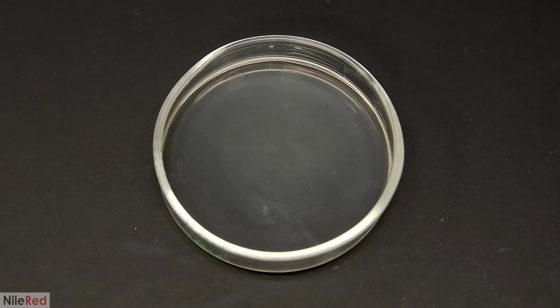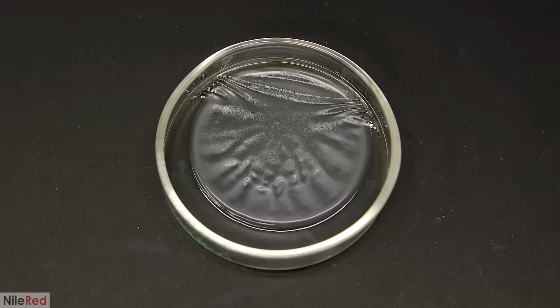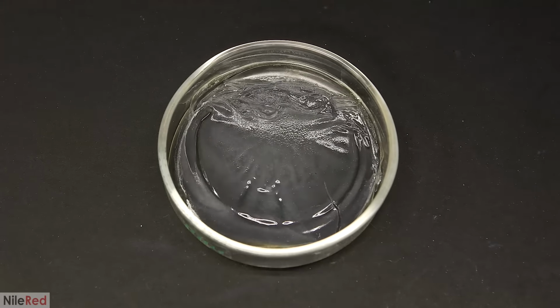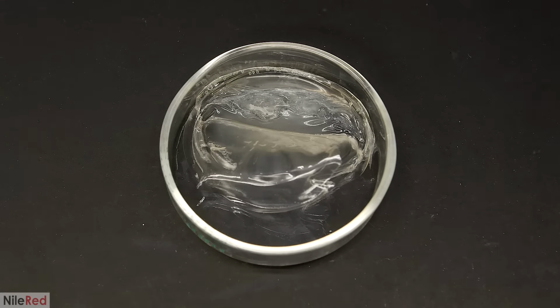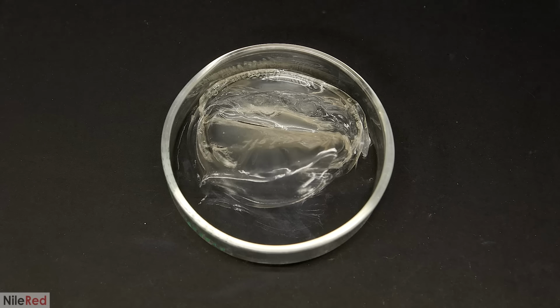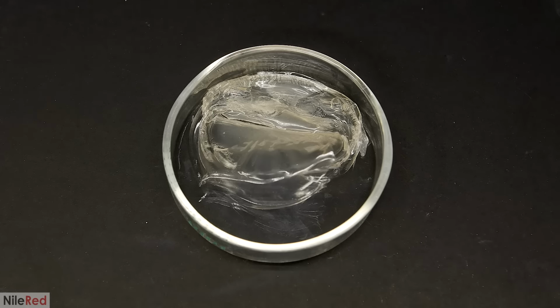I poured it all into a glass dish, and this time I decided to do a time lapse. I also wanted to see what would happen if I lightly blew on it with a fan, and the answer is that it's not good. The solvent evaporated off way too quickly, and the triacetate contracted in on itself. By the time all the solvent disappeared, what I was left with was really sad looking.